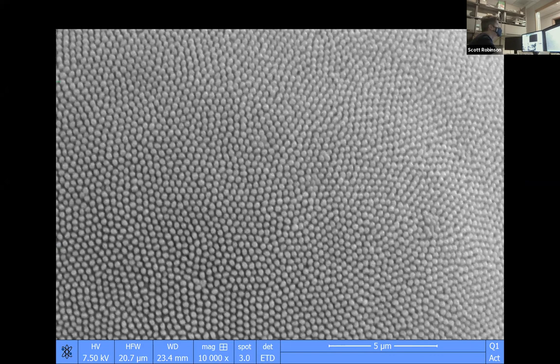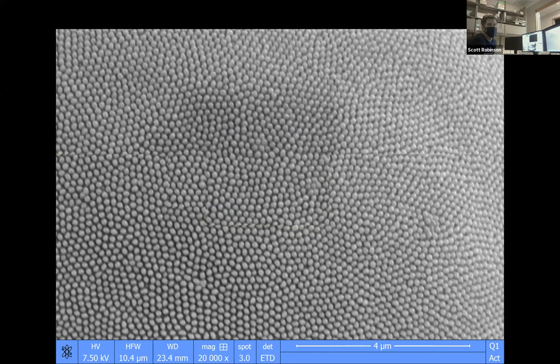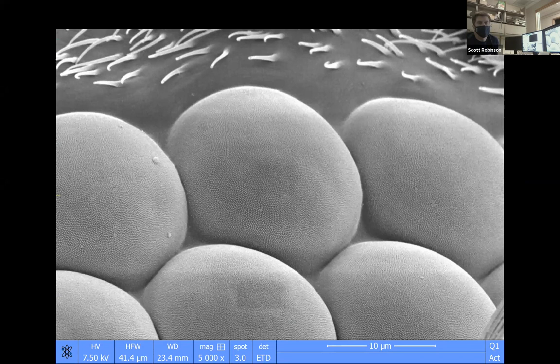So now we're looking at an individual ommatidium. Ommatidia are what the facets of the eyes are called, and these are the little receptors that mosquitoes use to capture light. And you can see that this little facet of the eye is round. That means that it gets light from many directions.